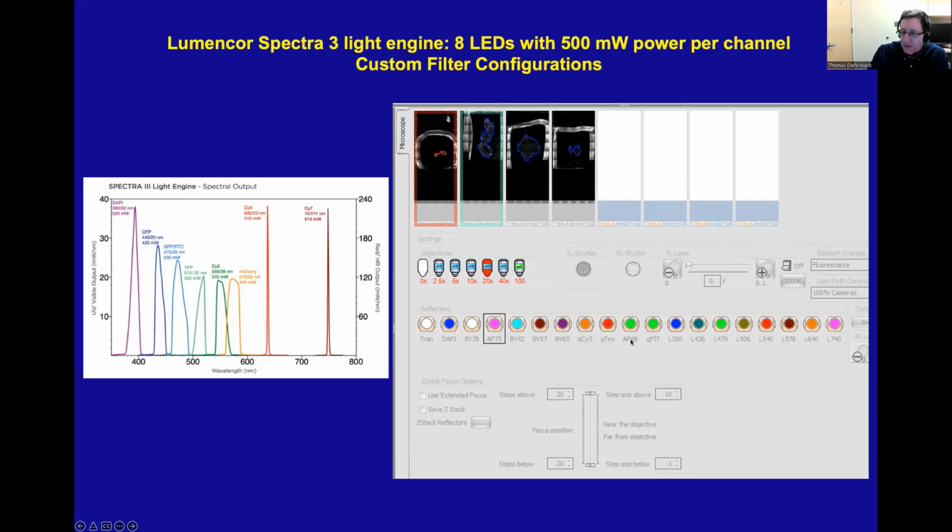The Alexa Fluor 488 cube is just left over from the original setup where we might want to check with a single band cube whether our quad band cube has crosstalk between the DAPI and the FITC channels. Then we have the Q-FITC. So all these other cubes on the right here, that start with the letter L, these are part of the original setup, and TissueGnostics has a different cube setup than this. This was just the original setup we had.